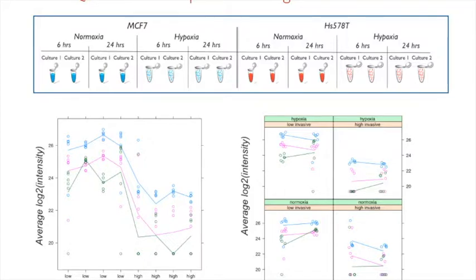And so we can see several things here right away. So, well, first of all, this is the low invasive condition, this is the high invasive condition. So clearly, the protein is down-regulated in high invasive condition, right? So that's pretty simple. But now, even there, you see the different lines, they're not parallel. So each peptide is a kind of, you can think of this as a technical replicate of the same protein, right? And you would expect that all the peptides behave the same way. Well, they don't, right? So here, this particular peptide flattens out, this particular peptide goes down, and this even more.